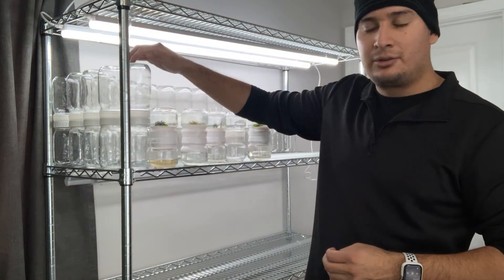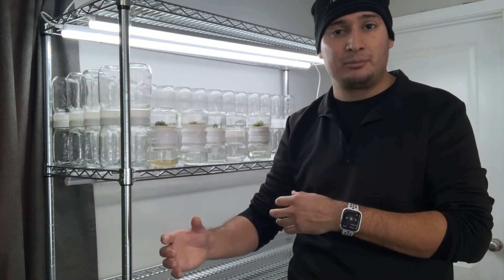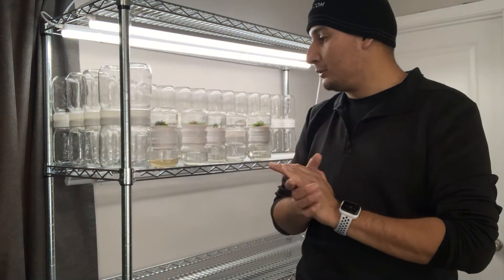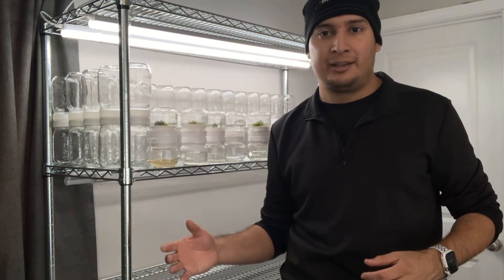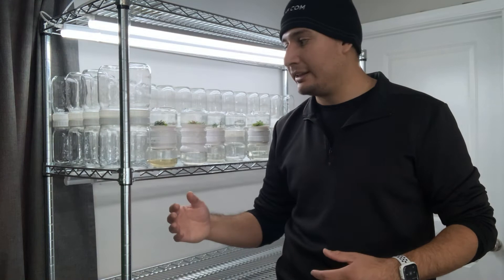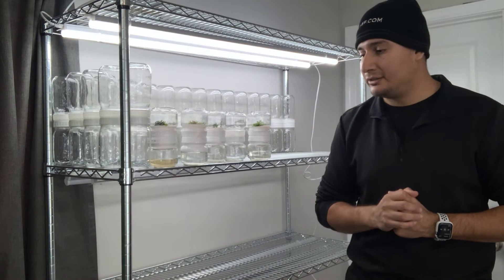Each month I want to do one biocoupler, so hopefully in about 5 months that's enough time to move the plants to whatever media they need or just to deflask them. I know some plants grow faster than others — some may fill the biocoupler in less than 5 months, and some may take longer.